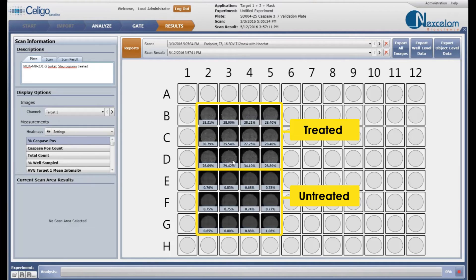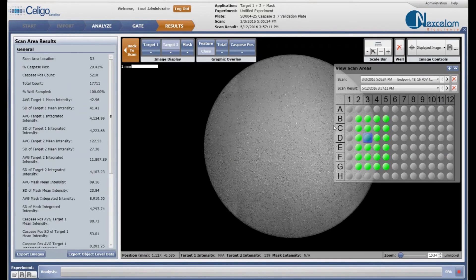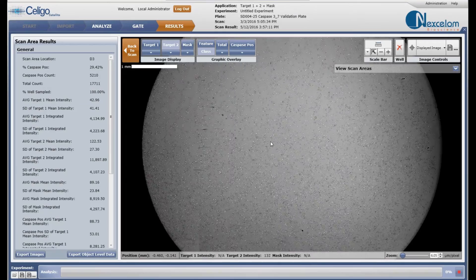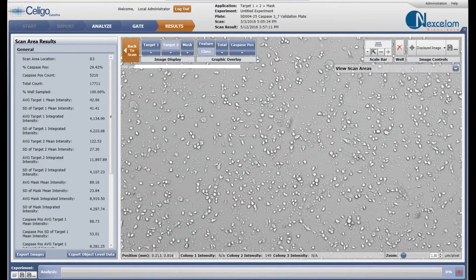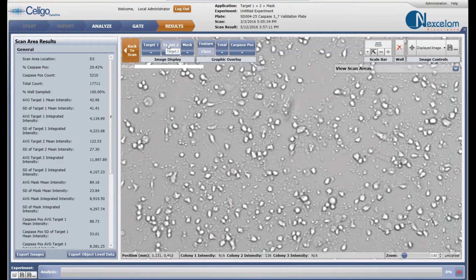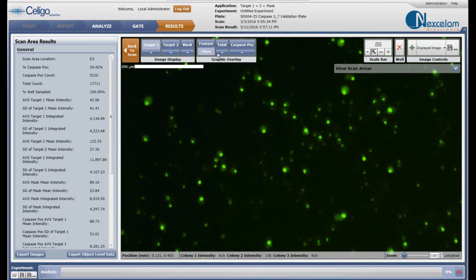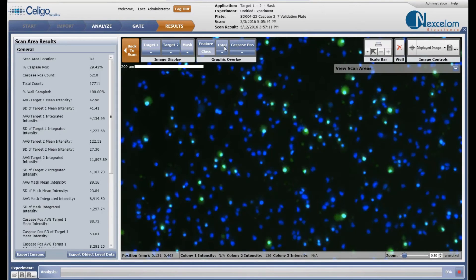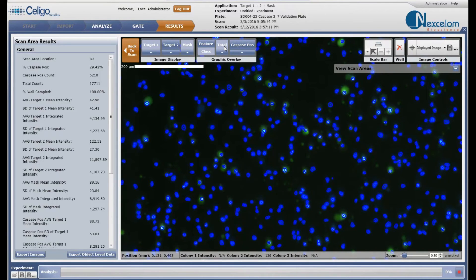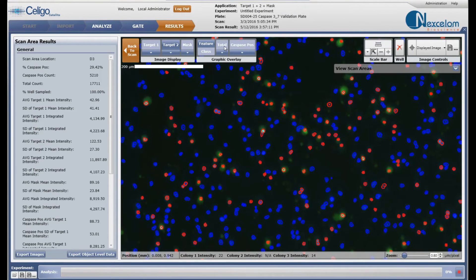Let's take a closer look at a treated sample in well D3. By double-clicking on the well, the whole well image appears for review. We can zoom in to look at the cell morphology in the brightfield image and examine the staining and counting of caspase and Hoechst-positive cells. In this merged image, the blue outlines represent the Hoechst-positive total cells and the red outlines represent the caspase 3-7-positive cells.